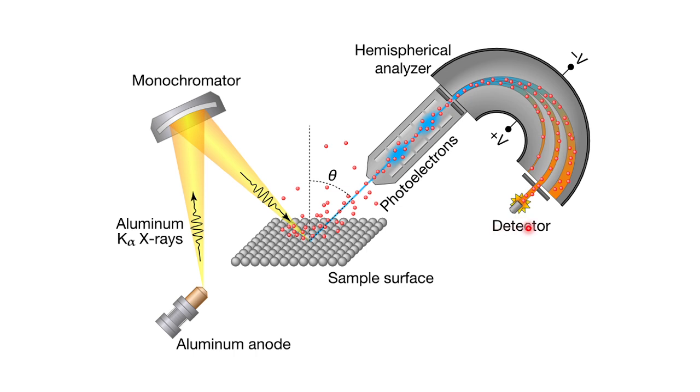After that there is a detector to check the binding energy. Obviously if there are different elements, the ejected electrons will have different binding energies. So for each and every element, since the binding energy is different, you can get which elements are present and what percentage is present.